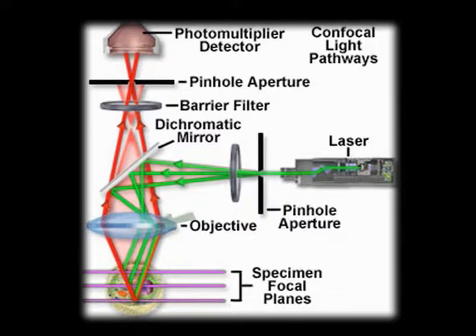After passing through the object, the light can be refracted or slightly deviated, and the fluorescence light which is obtained is collected by the objective. This objective now passes it through an emission filter, and then it passes through another pinhole.